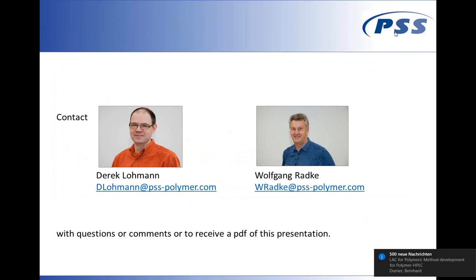If you, however, would like to investigate, for example, a blend by LAC for polymer and would like to determine the molar mass distribution, or you would like to separate the blend by critical conditions, then you have to make sure that your visible blend component is shifted far enough from the invisible component.